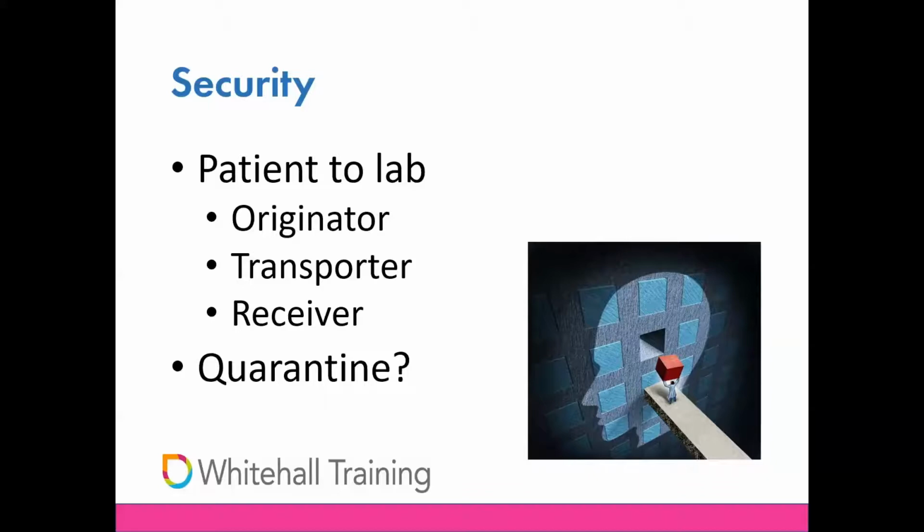In terms of the transporter stage, just like in GDP, samples need to get from their source to the lab in such a way that their integrity and viability remains unaffected, whatever the distance and timelines involved. Again, like GDP, particular attention needs to be given to how long the samples are going to be in transit, conditions that ambient shipped samples might be exposed to during transit, temperature monitoring, etc. If the samples are frozen or refrigerated, there needs to be constant temperature monitoring, possibly with printouts given to the lab on delivery.